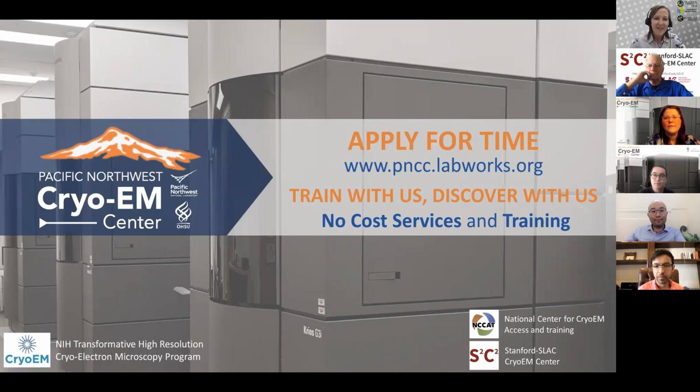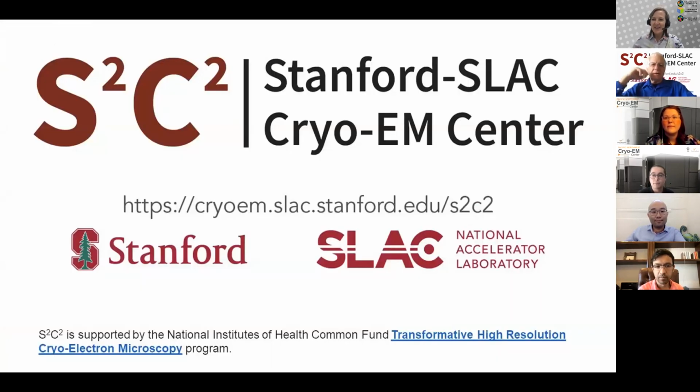Thanks, Theo. And Mike? Hello, I'm Mike Schmid, and I'm one of the co-directors of the Stanford SLAC cryo-EM Center. As with the other 2 centers, we have access for high-end data collection and training. We have 3 Krios microscopes with K3 and Falcon 4 cameras. Some are equipped with energy filters.